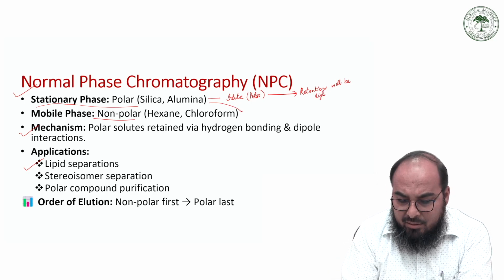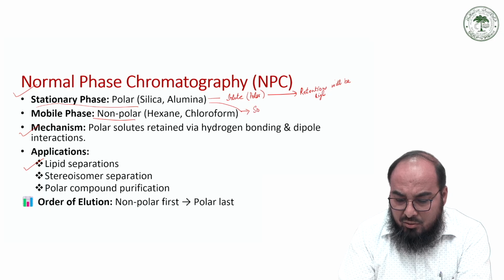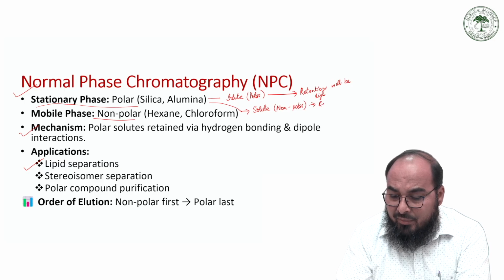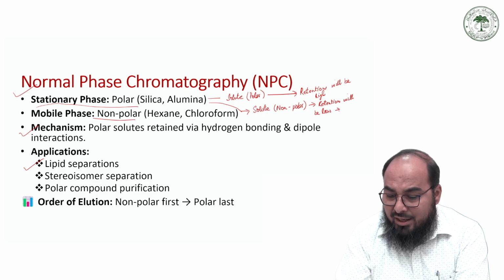But at the same time, if your solute is non-polar, the retention time will be low, or you can say elution will be fast.